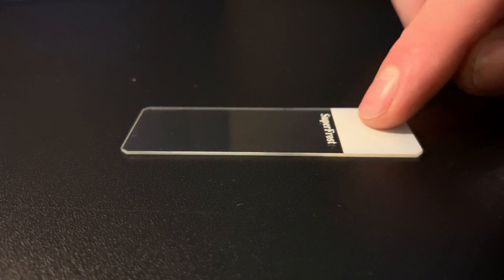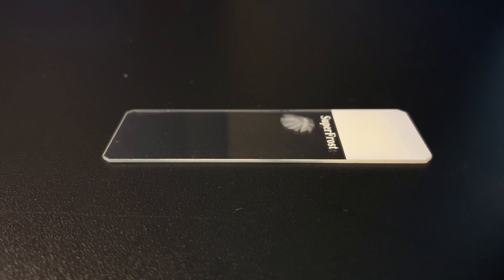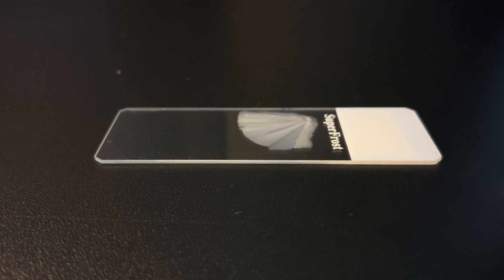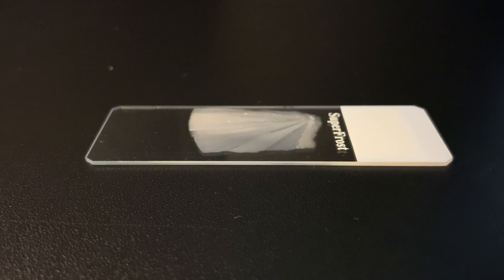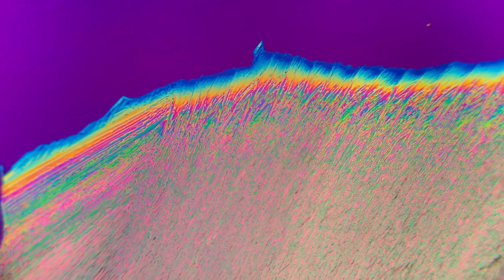When we then take the solution, put a thin layer on a slide and let it crystallize, the molecules rearrange themselves to form a solid. The spacey colors we see with the polarized light appear because some crystals are what is called birefringent. This means that light will behave differently depending on the way it enters the crystals.